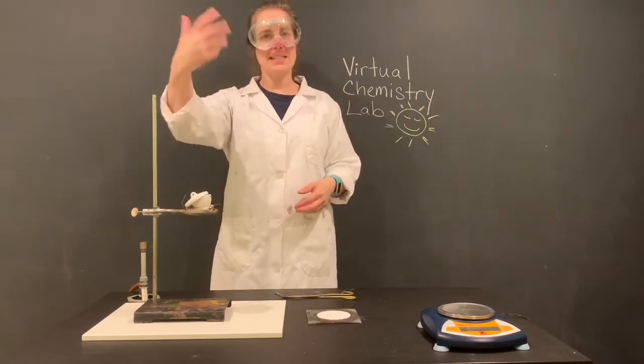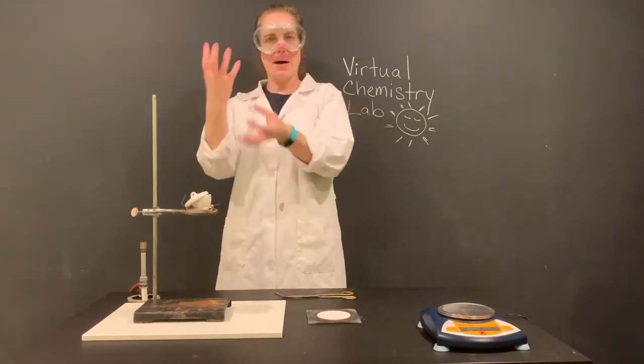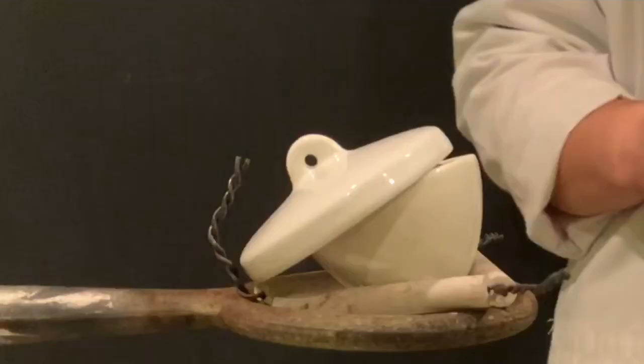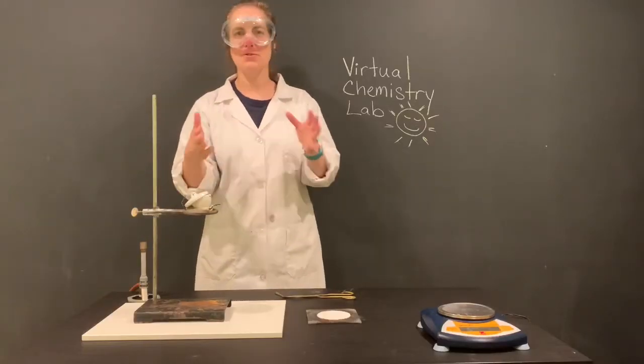And that's so that the gases can escape, and also so block any kind of popping that might happen and cause a safety hazard. So we've got that there, and you see I turned the clay triangle up to sort of help catch the crucible top.